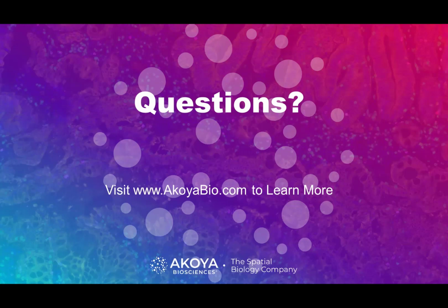I will say that we've just begun using this, so I think that's a great control experiment, and it definitely should be done on a marker like cytokeratin or something where you know the signal's really good and you want to see it go up or down. But my guess is if anything, it would increase the sensitivity.